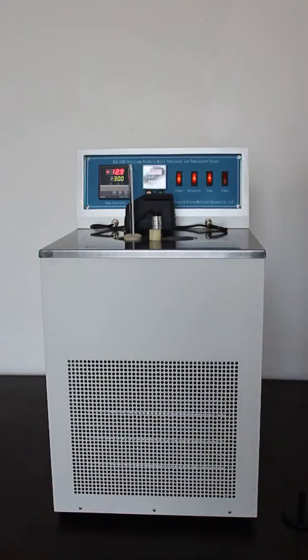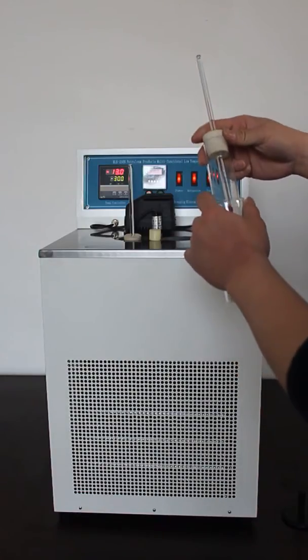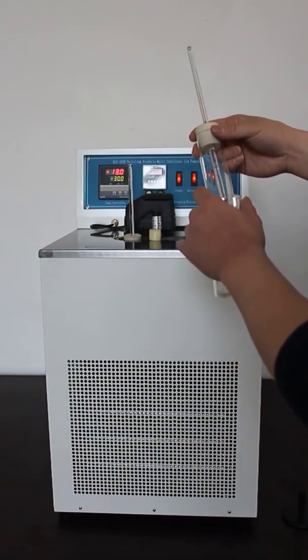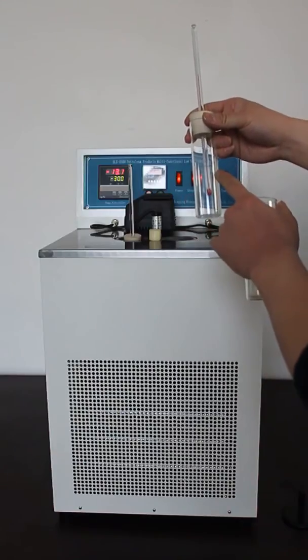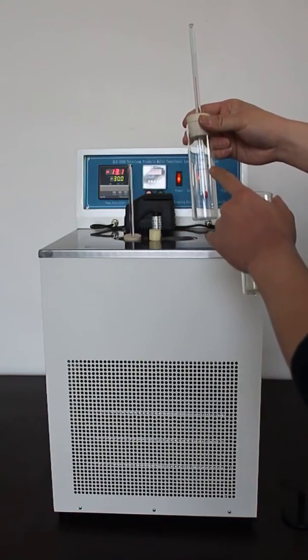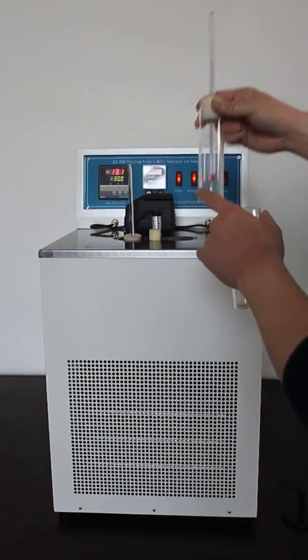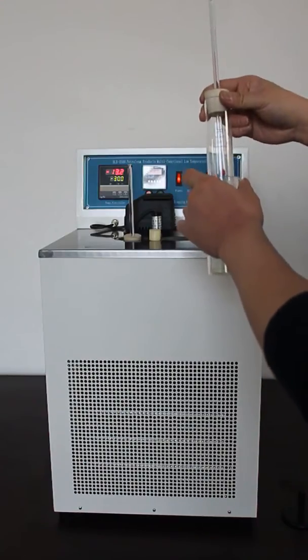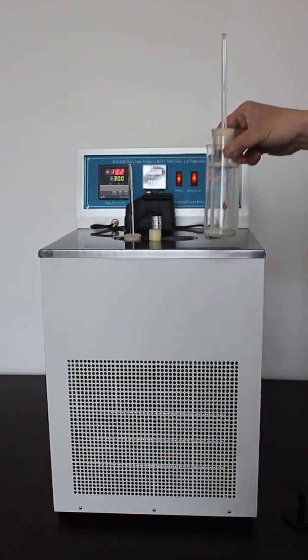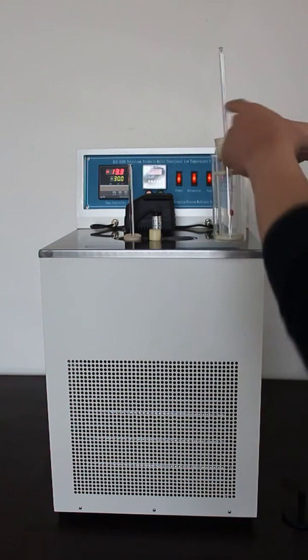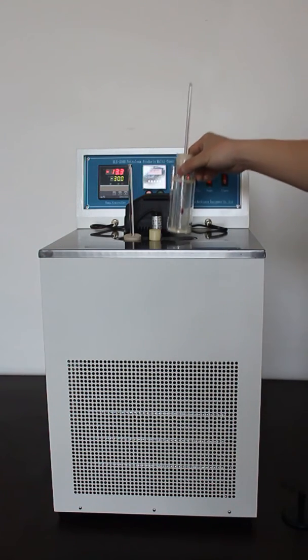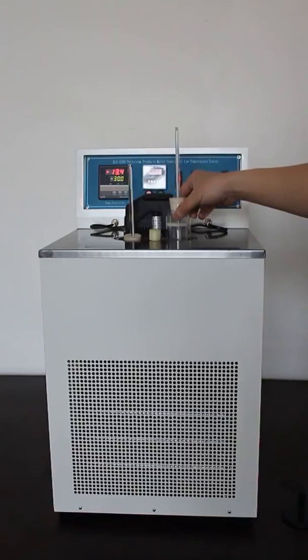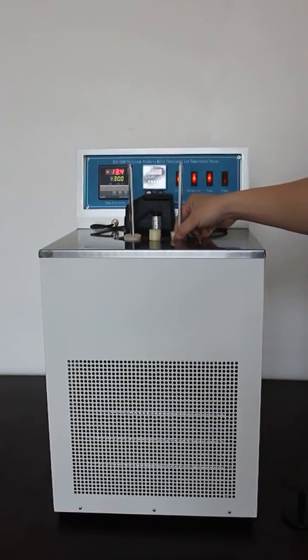For the cloud point test, put sample into the inner tube to 45 ml. Place it into the outer tube with rubber block and a thermometer. Place it into the sample holder.